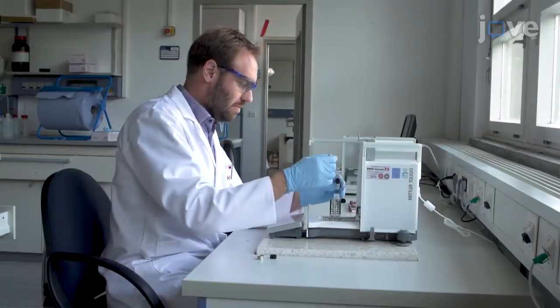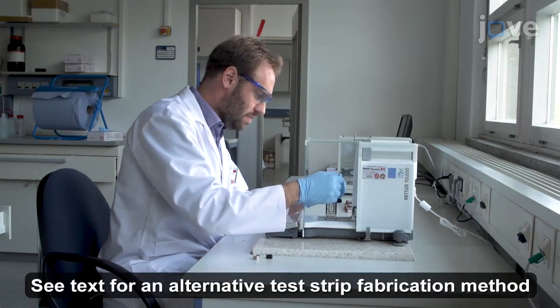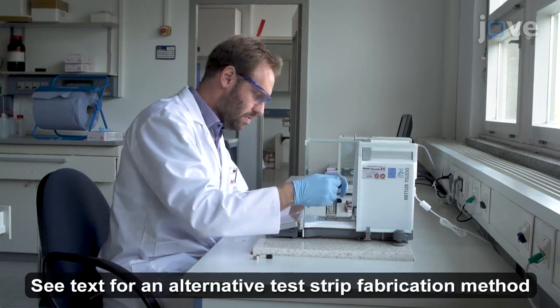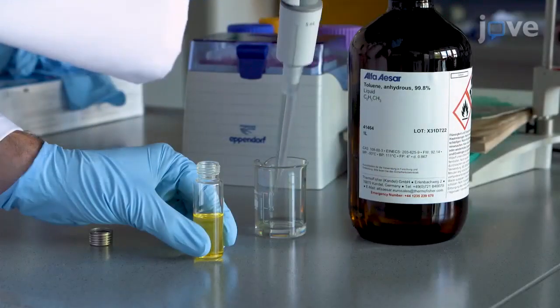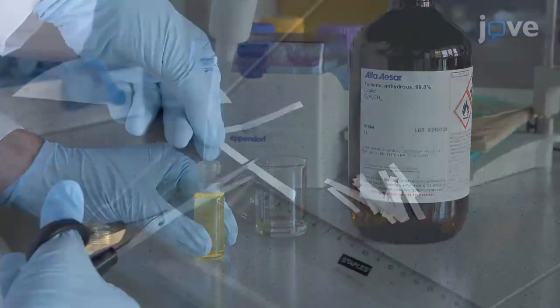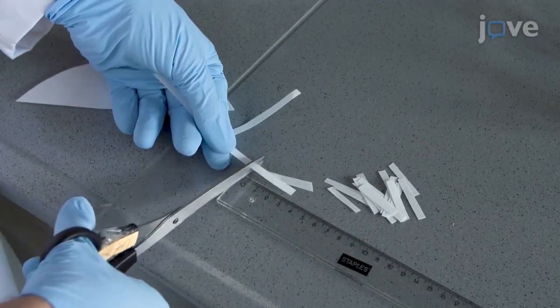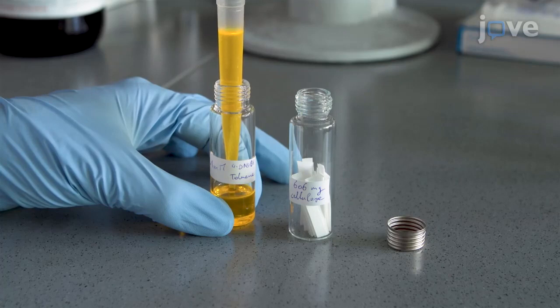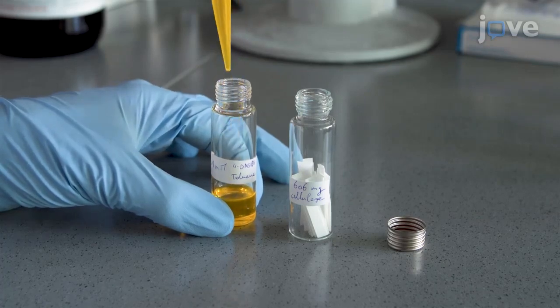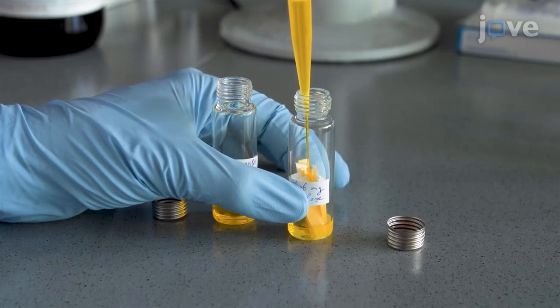Prepare 1 millimolar solutions of the reference dye and dyes 4-DNS, 4-DNSOH, and 4-DNS-COOH in toluene as described in the text protocol. Cut cellulose strips of 30 by 5 millimeters from filter paper. Place approximately 50 of those strips in a sealable 5 milliliter vial together with 4.5 milliliters of the desired dye solution.